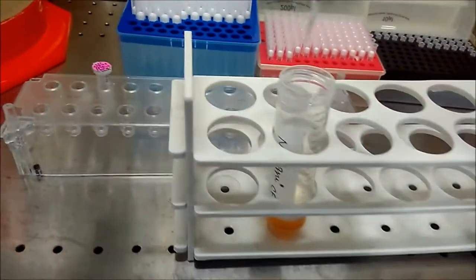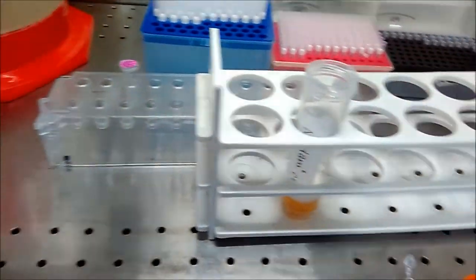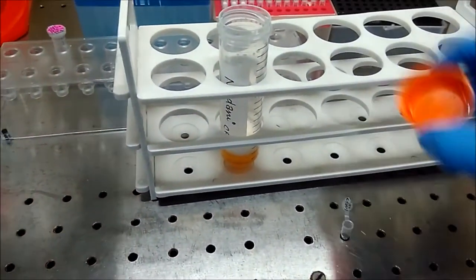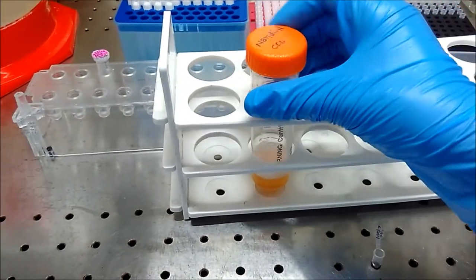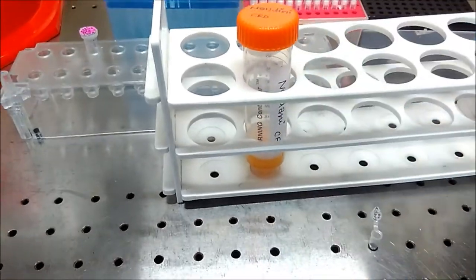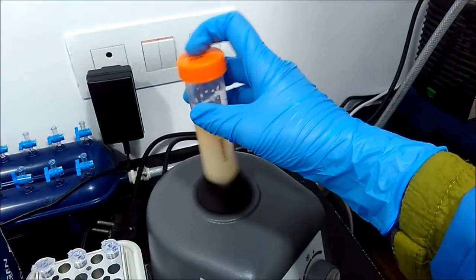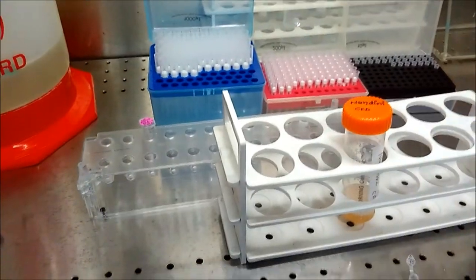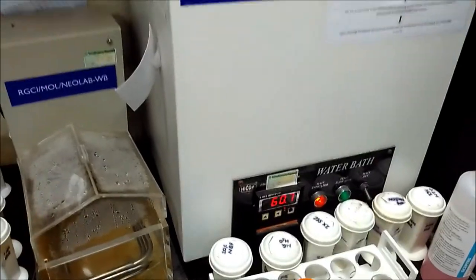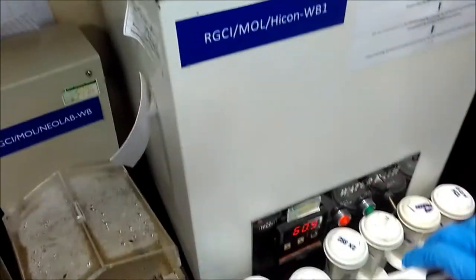After that, we will add 5 to 6 microliters of carrier RNA to our lysate. This basically enables efficient binding with the silica membrane that we are going to use. After adding carrier RNA, I am going to vortex it. After vortexing, we will keep it in a rack, and that rack we will put inside the water bath at 60 degrees centigrade.